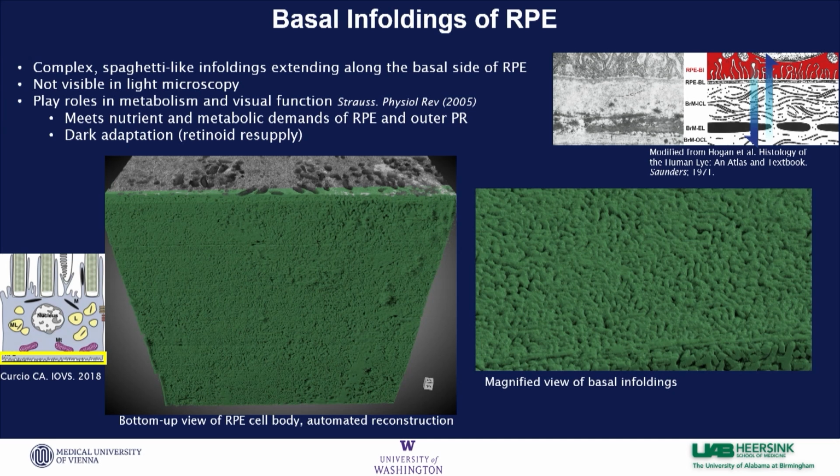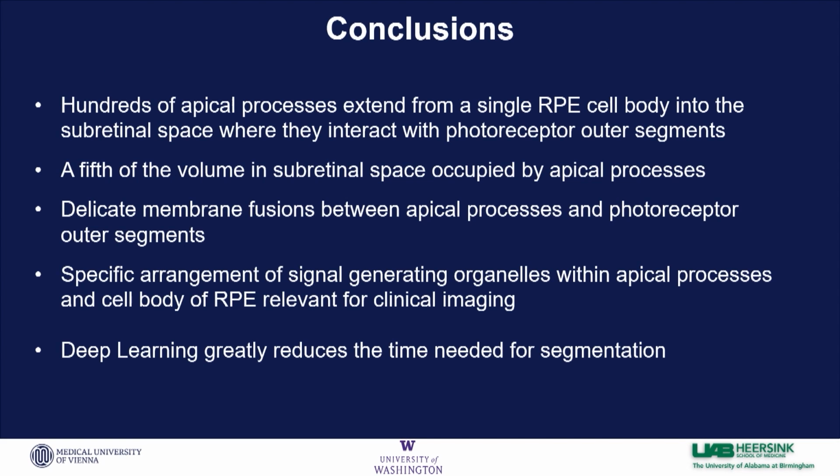All of this is very exciting for us, because we were able to accomplish all this in a very short time with one computer and one or two people maybe working on it, on the deep learning part at least. And we were able to find out that, combined with manual segmentation, these over 800 processes extend into the subretinal space and form these intimate connections with the photoreceptors. Basically, our work has been more than cut in half by the deep learning aspect of Dragonfly.